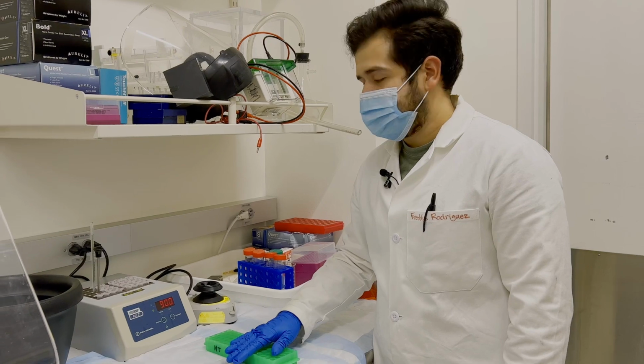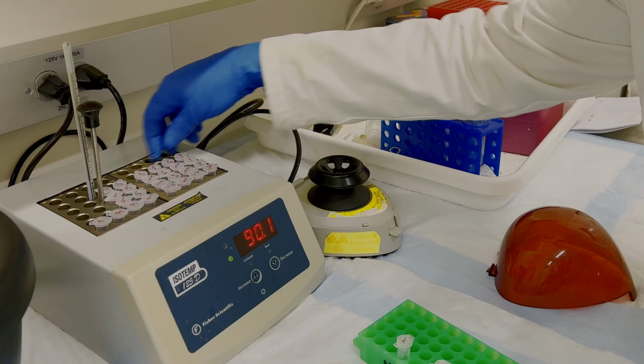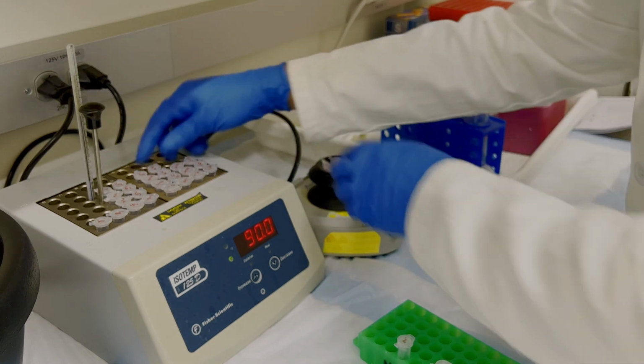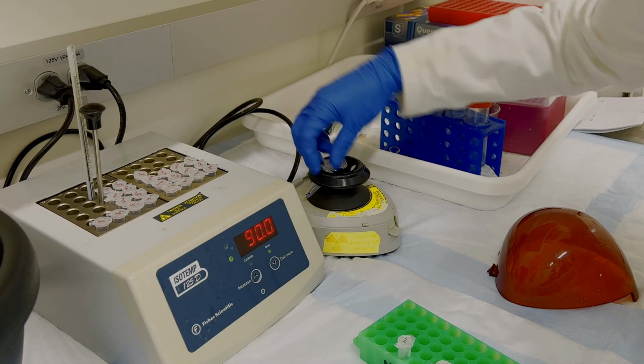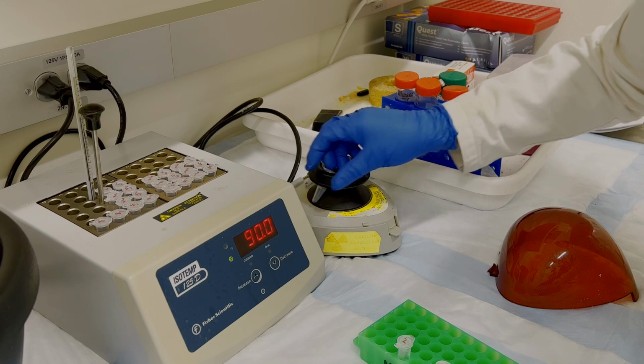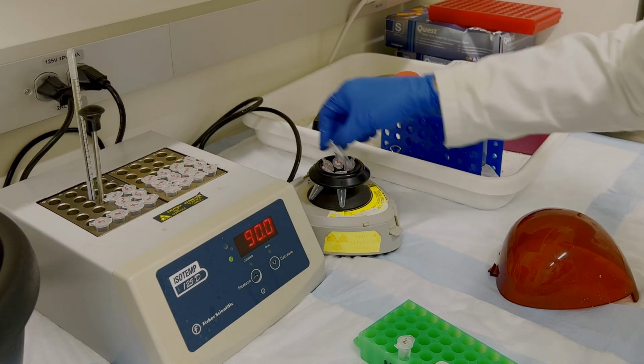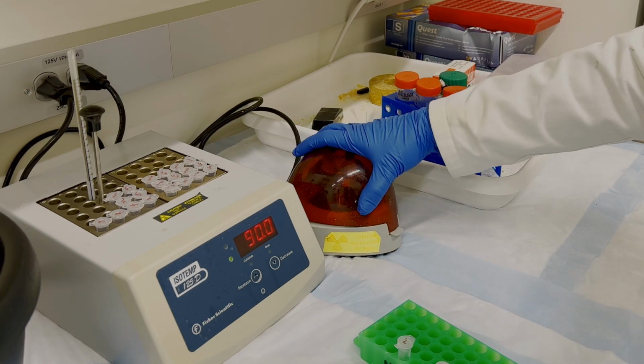One of the other things that you'll want to do right before you put your samples onto the gel is that sometimes whenever you put on your samples, they can evaporate a little bit. And to combat that, once you start taking your samples off of the heat block, centrifuge them down for just a few seconds to get all that water that's evaporated up to the top of the cap downwards.